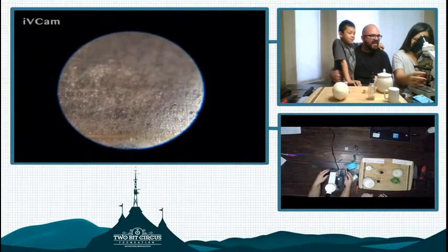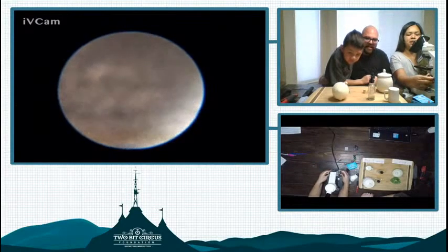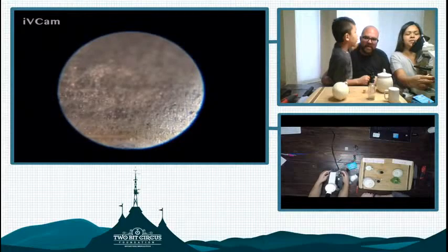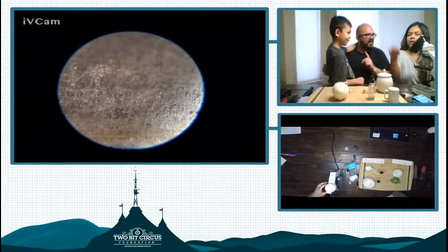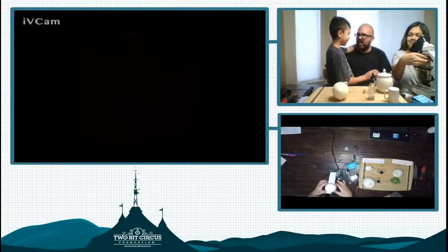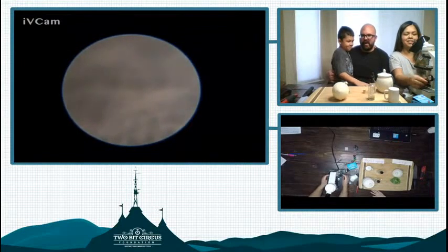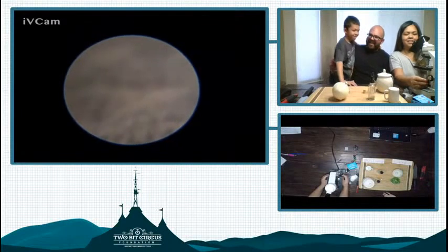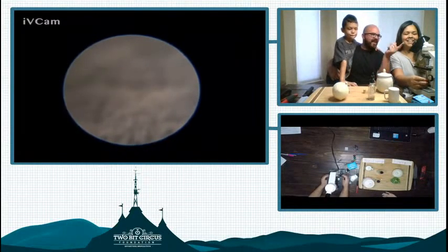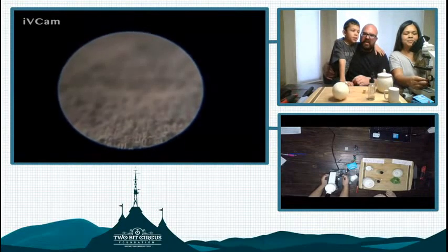So when you're at the lowest objective, you can use the big knob, which is the coarse objective knob, the coarse knob, which moves your stage up and down really fast. Oh, that's how it works. I was just over here moving it around till I saw something cool. Was that what you were doing, Robert? Awesome. So let's look at that picture. You could either look at the camera here, or you could look at it on our screen here. And can you see anything in that picture?